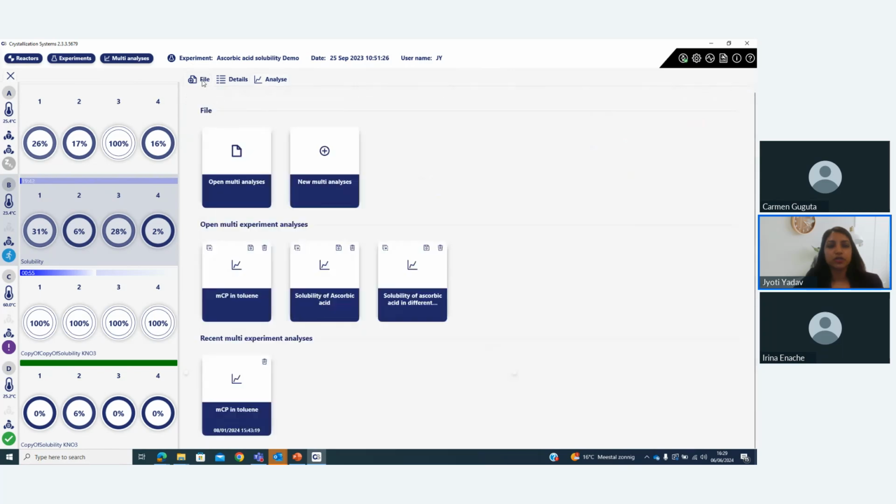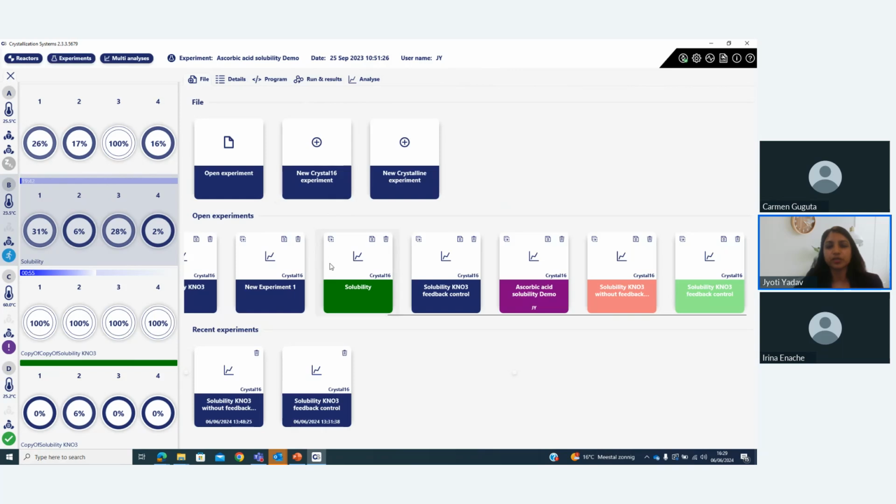Now maybe I can show you one. Go to experiments, back to experiments. I can show you a feedback control experiment.